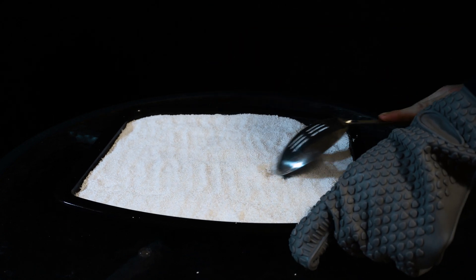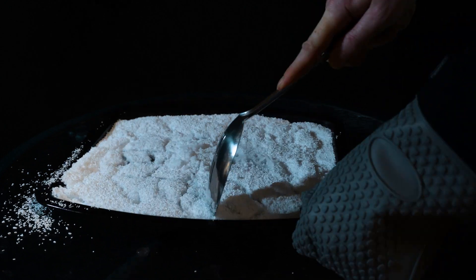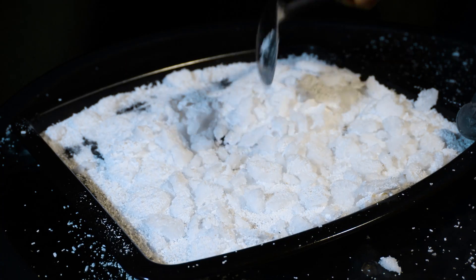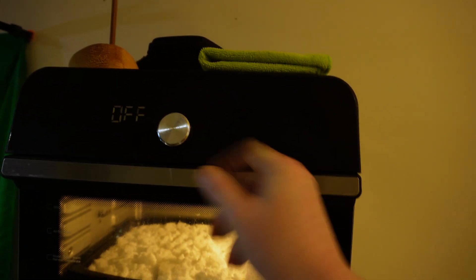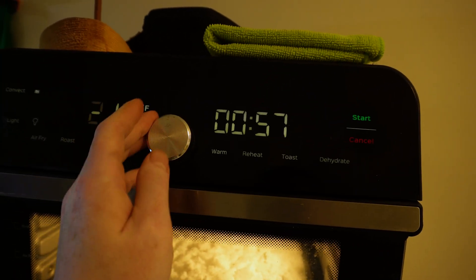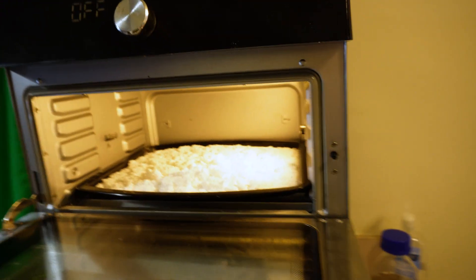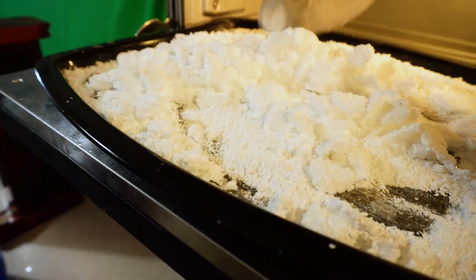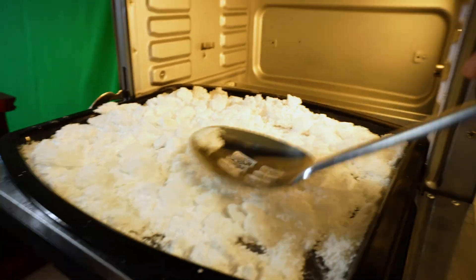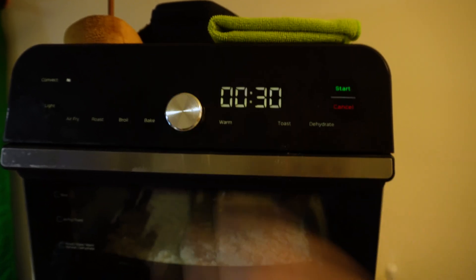After an hour you'll want to take it all out and stir it. Scrape the bottom of the pan really well, because if you don't it will stick to your pan like some sort of super concrete. Put everything back into the oven and raise the temperature by a decent amount. Repeat the process again and raise the temperature incrementally, using about 20 to 30 minute heating times.